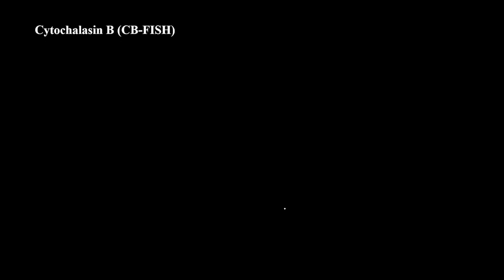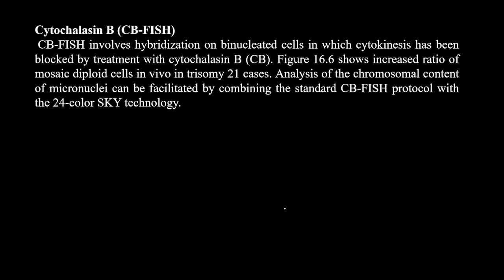Then coming to cytochalasin B. Cytochalasin basically stops the cytokinesis. When the cytokinesis is stopped, you have two nuclei, right? Why are we using cytochalasin?